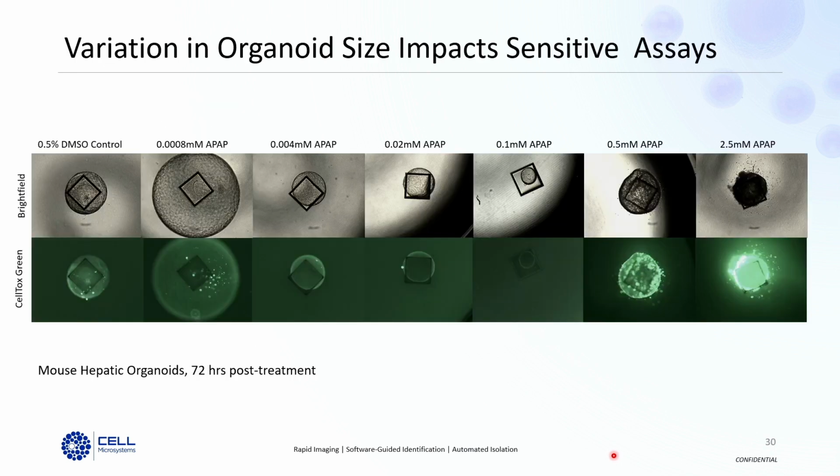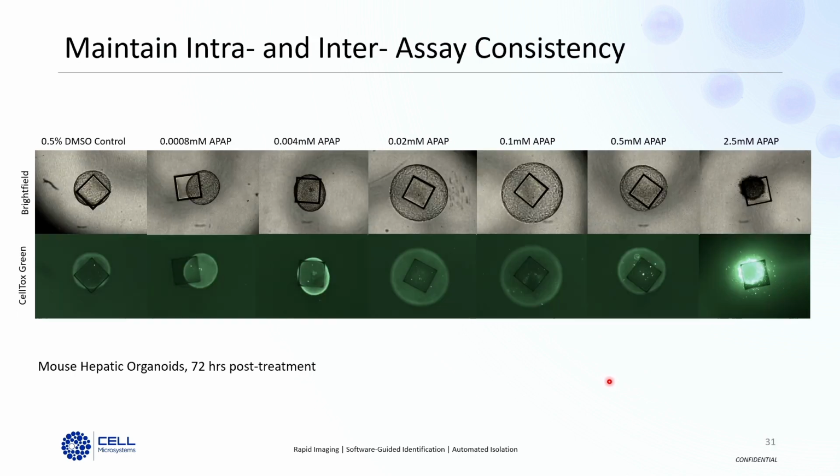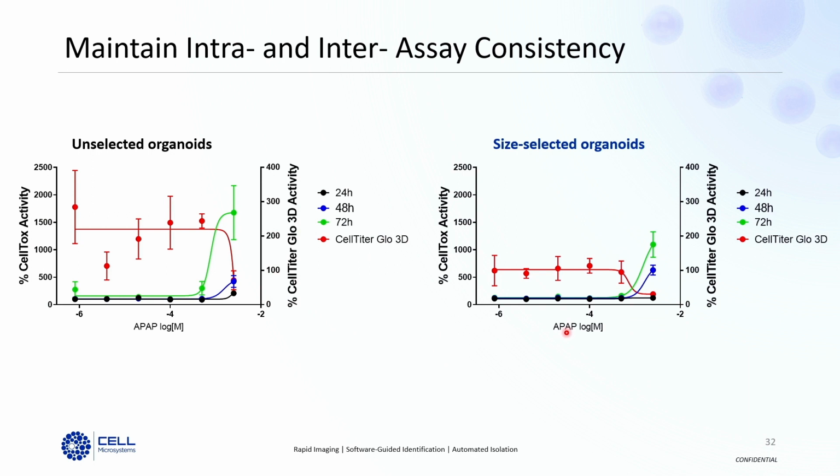So here you're looking at 72 hours post-treatment, that unselected population of organoids. Just to orient you, these cell rafts are 500 by 500 microns. So this organoid here is probably roughly 2 millimeters in diameter, whereas this one is maybe 300 microns in diameter. For those of you who have used these types of assays that are really reliant on cell number, you can imagine the havoc that this wreaks on your reproducibility, right? Using the cell raft array, we were able to select those organoids based on size, get much more consistency in our downstream assay, and just as you would expect, this has an impact on our assay as a whole.